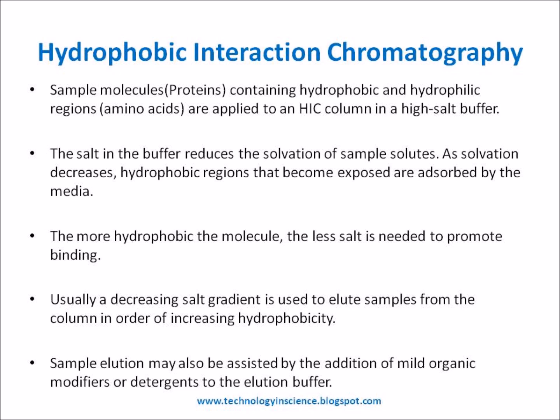Proteins containing hydrophobic and hydrophilic regions are applied to a hydrophobic interaction chromatography column in a high salt buffer. The salt in the buffer reduces the solvation of sample solutes. As solvation decreases, hydrophobic regions that become exposed are adsorbed by the media. The more hydrophobic the molecule, the less salt is needed to promote binding.